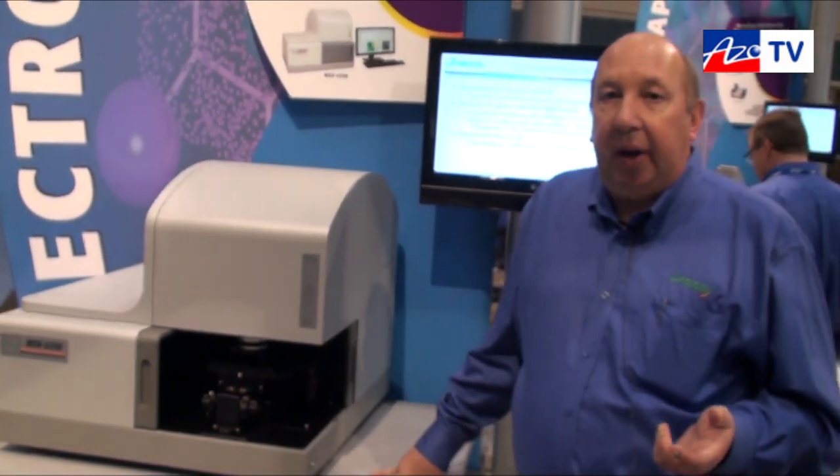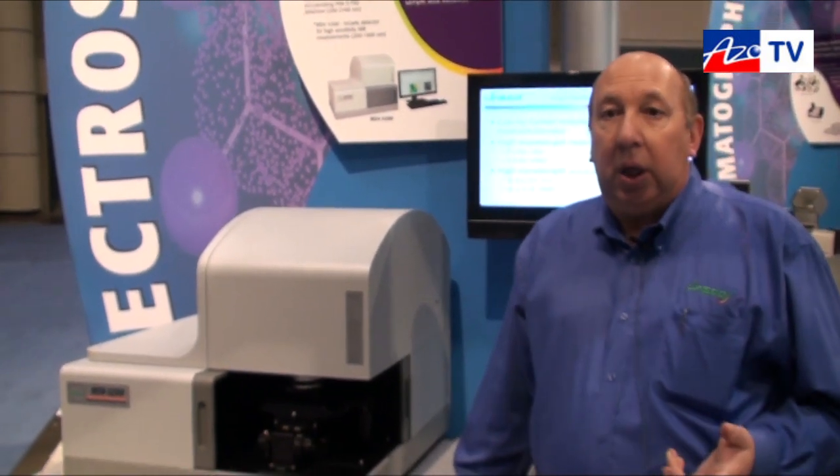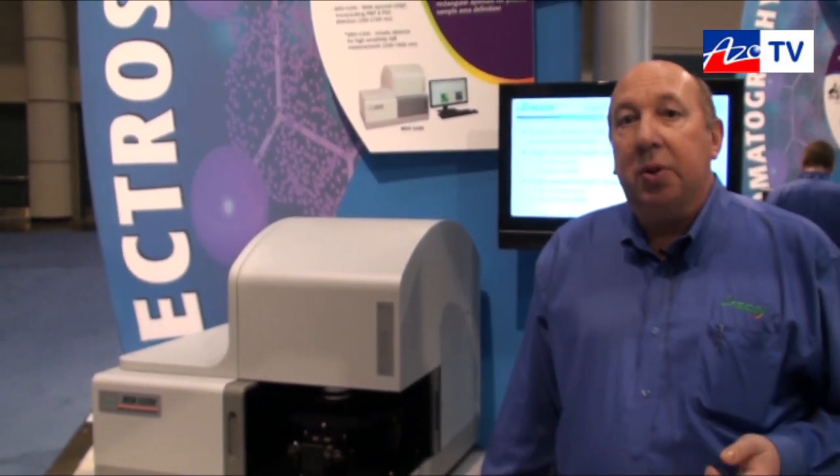The MSV5000 series is the second generation of this type of microspectrophotometer and we're very happy to bring this to our customers, hoping they'll find it very useful for their research and QC applications.